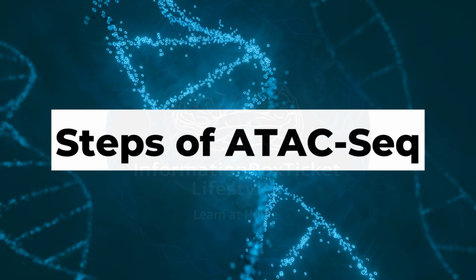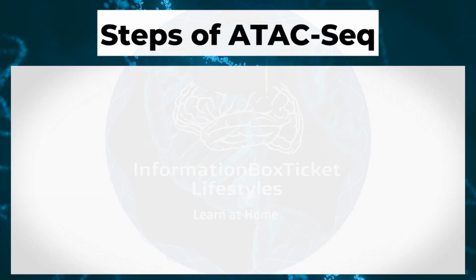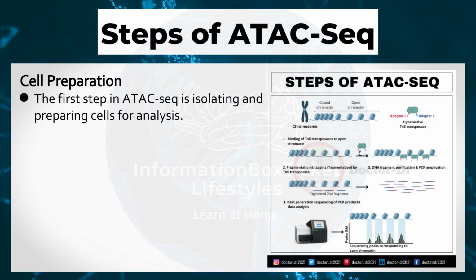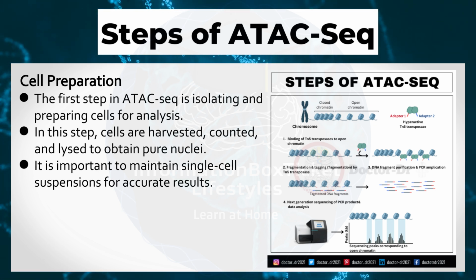Steps of ATAC-Seq. Cell preparation. The first step in ATAC-Seq is isolating and preparing cells for analysis. In this step, cells are harvested, counted, and lysed to obtain pure nuclei. It is important to maintain single-cell suspensions for accurate results.